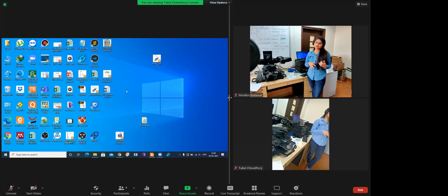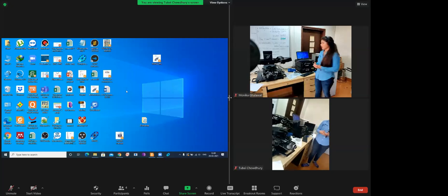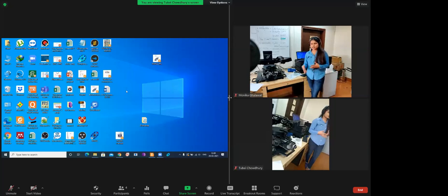The steps will be the same. You just take experimental data as we have taken in this software. There also we can generate our data. So I will ask my junior Tubai to explain the Complete Ease software.